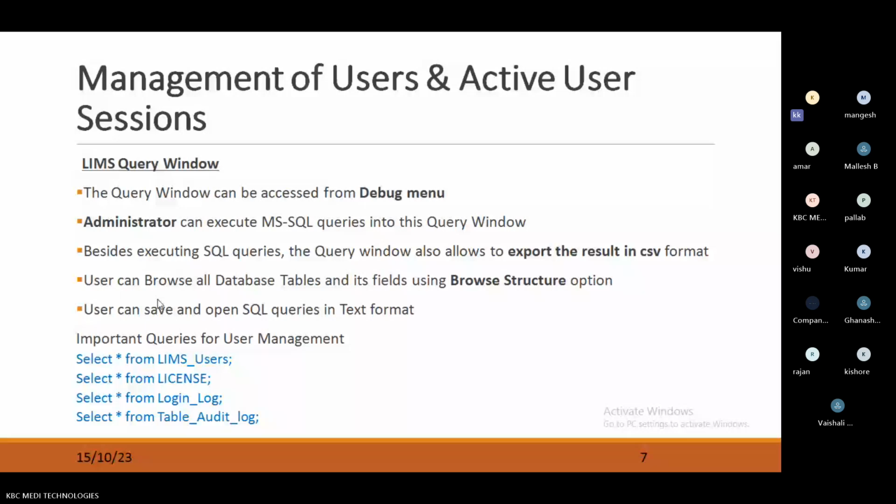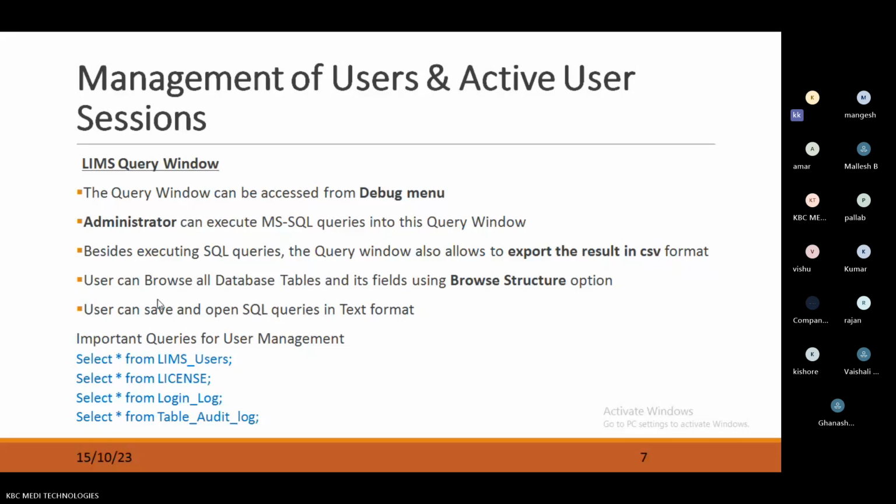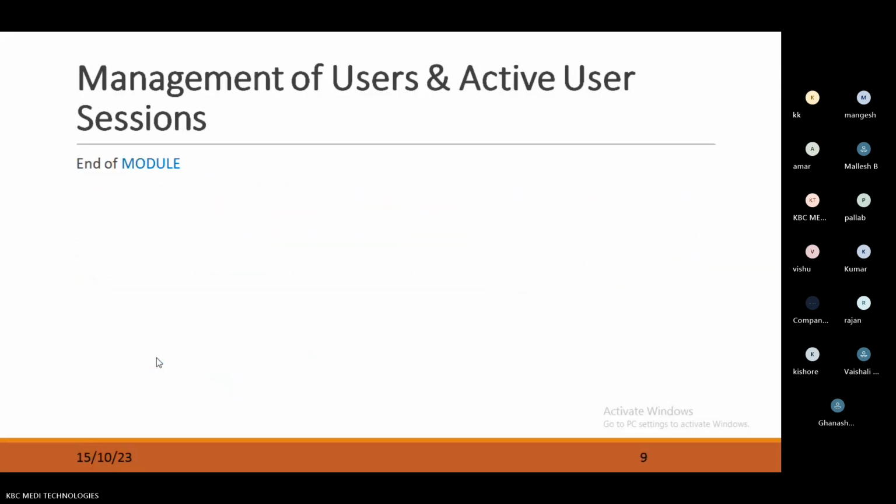This LIMS query window helps you identify issues. For example, if you are in the supporting team or LIMS master data team and someone made a mistake at laboratory level, you are the LIMS administrator. With the help of this query window, you can trace error logs or any other information, and shortcut data also. This is simple, nothing but your Excel.